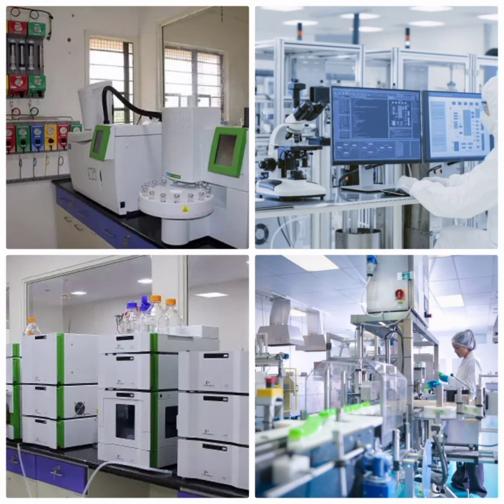We have also talked about relative costs, where we have seen that GC is of low cost compared to HPLC. We have also talked about application of the techniques based on suitability.